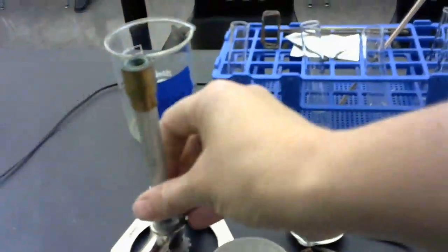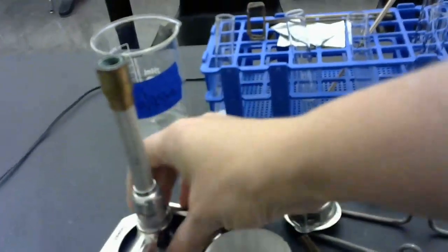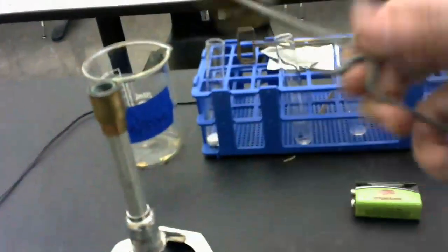When I look at my Bunsen burner, right here I can adjust the oxygen that's coming to my flame. Right here, I can adjust the amount of gas that's coming to my flame. And then this is my striker.